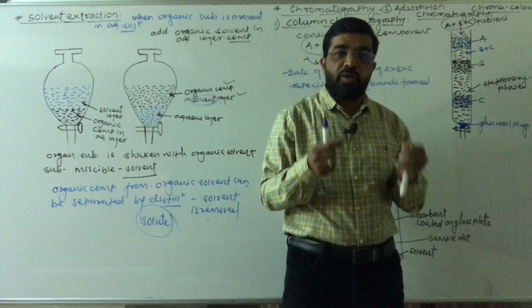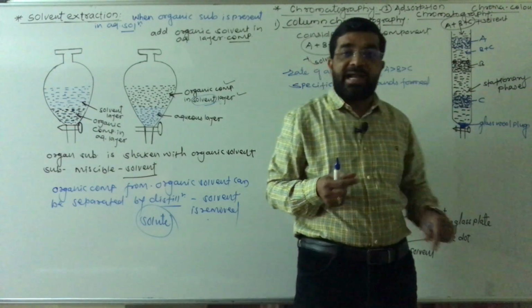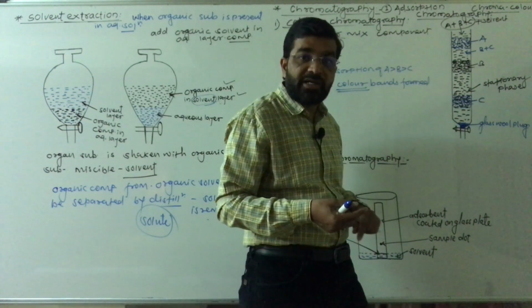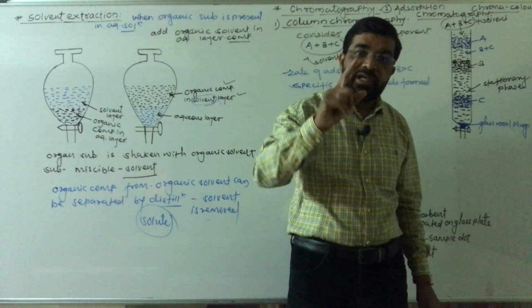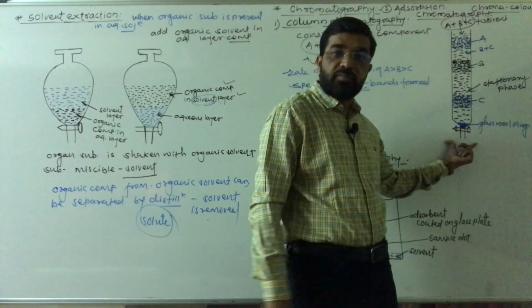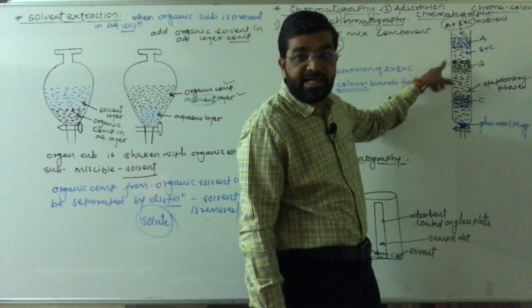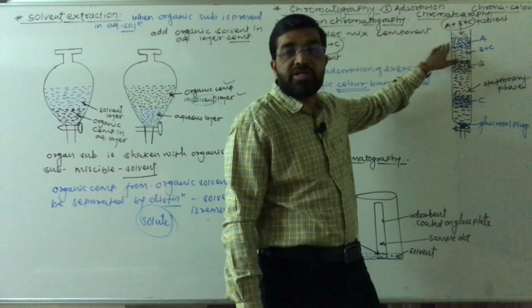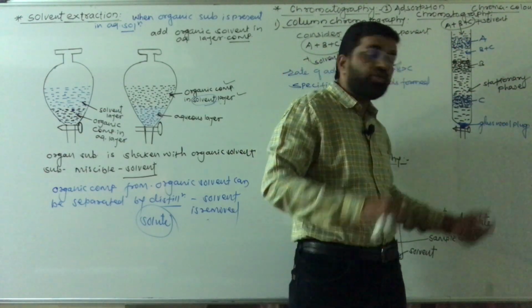The process of removal of adsorbed molecule from the surface of this adsorbent is called desorption. So desorption starts. Now, whose rate of adsorption is less, its rate of desorption is high. Therefore, in the first flask or beaker, C is collected, later B gets desorbed and is collected in the second flask or beaker, and in the third flask or beaker, A is collected by using this stopcock.